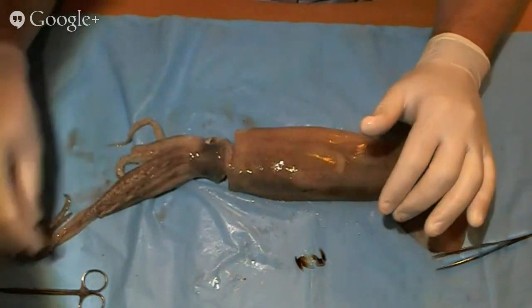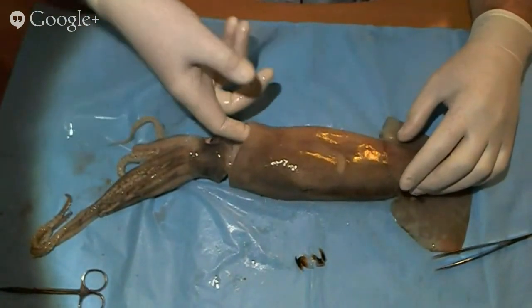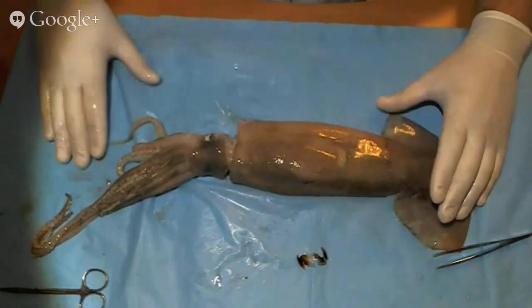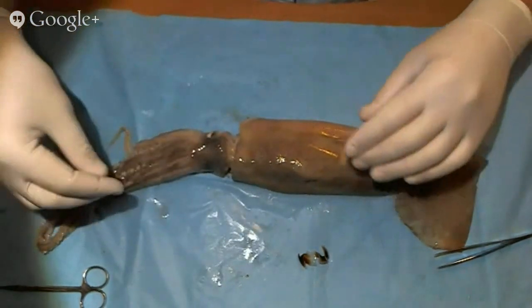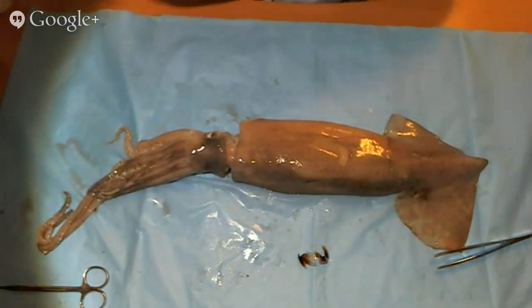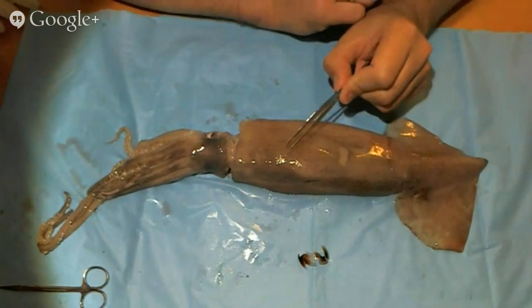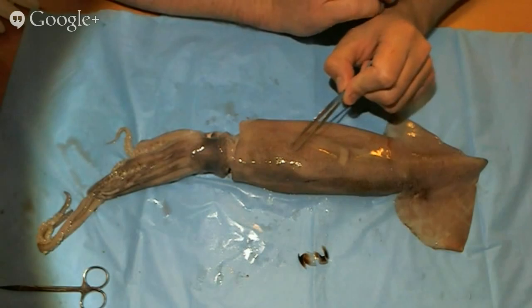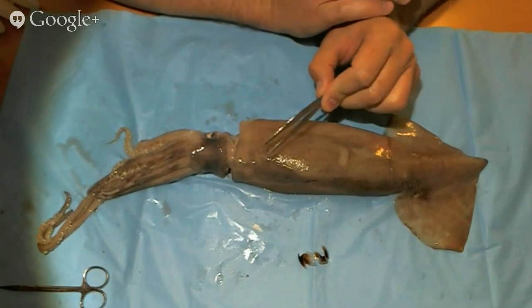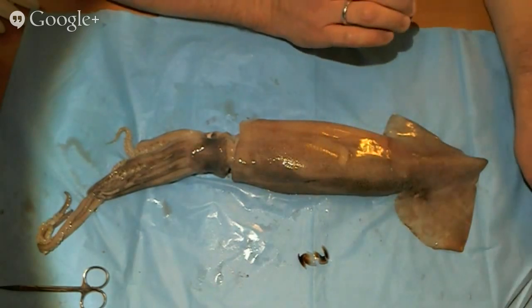We talked a little bit about how it reproduces. To see how it breathes, you have to get up inside, and we talked about how it grows as well. So before we get too far inside, I want to see if I can switch over to sharing my screen and get a view of these little dots on the outside of here. These little dots we're going to talk a little bit about later, because these are what are inspiring the art project for today. Those little dots are called chromatophores.